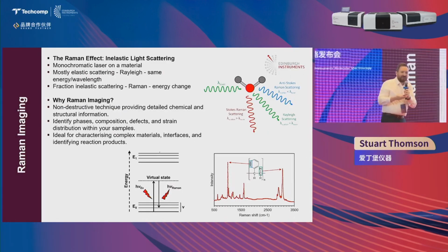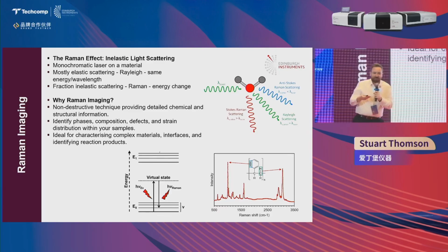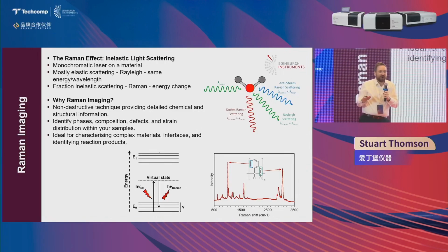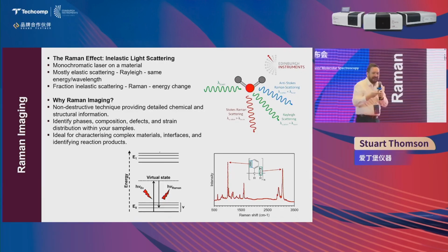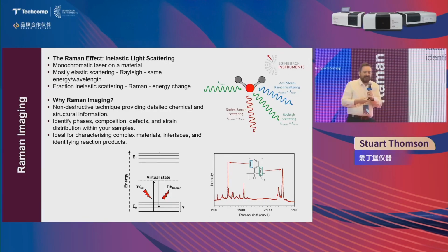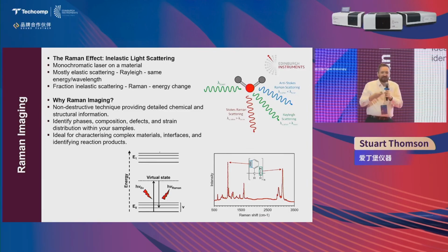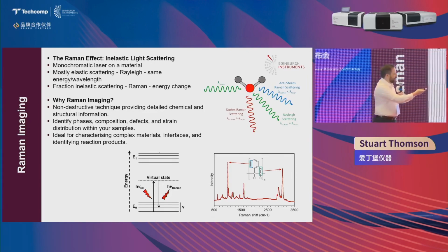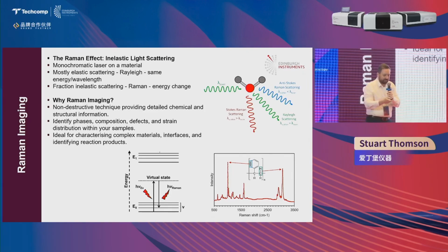The first type of imaging on the RM5 and the RMS that I'm going to discuss is Raman imaging. And we just heard a lot about Raman in the previous talk, so I'll go through this slide quickly. But in essence, it's an inelastic scattering technique that provides chemical information about your sample. So it essentially provides a chemical fingerprint as different functional groups or different phonon modes give a unique Raman spectrum.